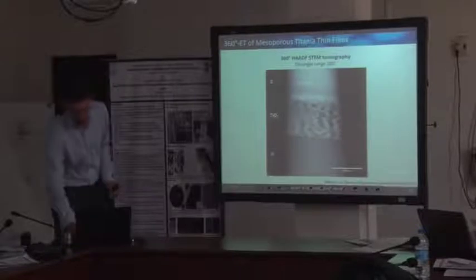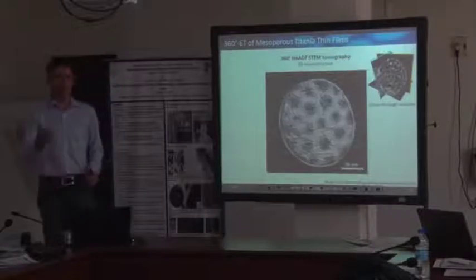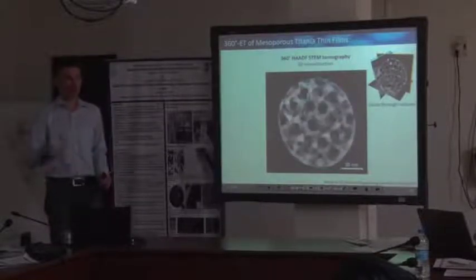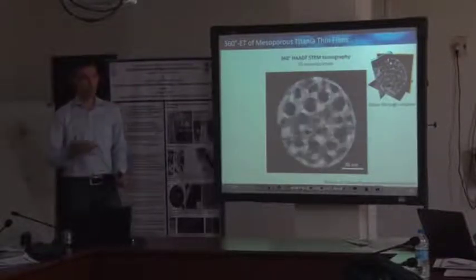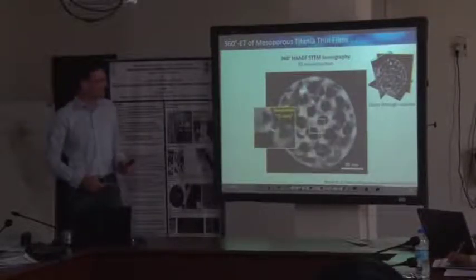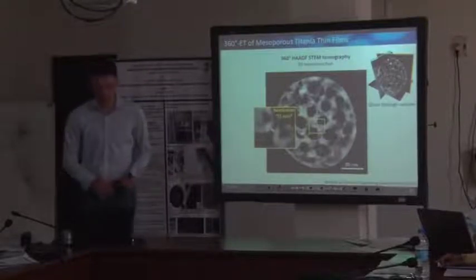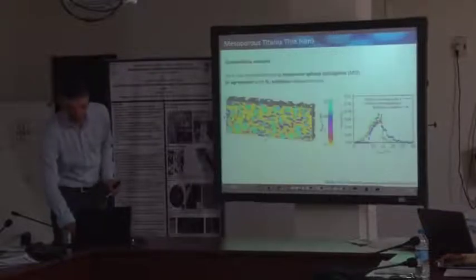There are, to some extent, just limitations, because in HAADF, the measuring time for one image, for one projection, might strongly exceed the measuring time in ADF, so the signal might be pretty low, and you might introduce damage of the material, and so you are somehow limited in that respect. But nonetheless, here are features like pores which are separated with a resolution of around 1 nanometer cubed, and this is the resolution that you are able to achieve for such measurements.